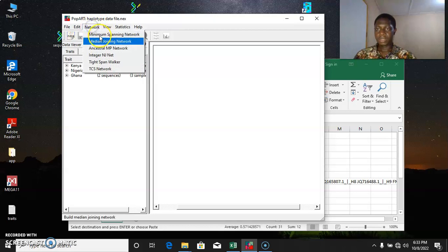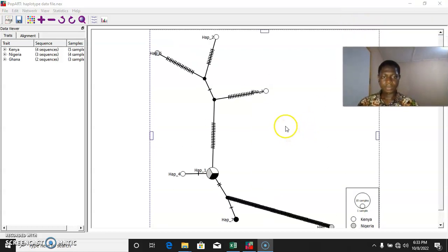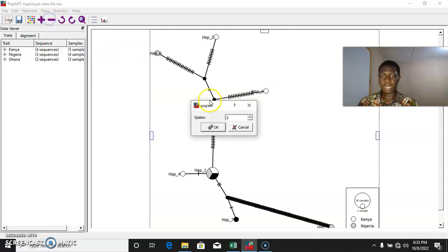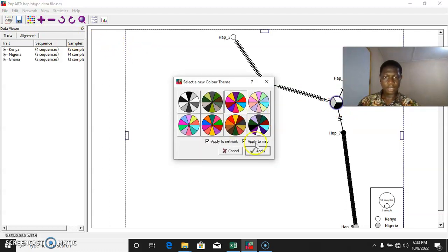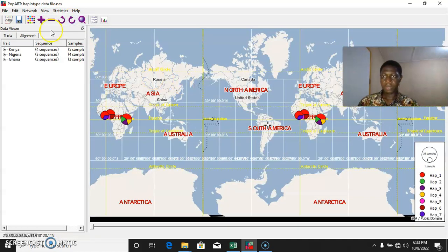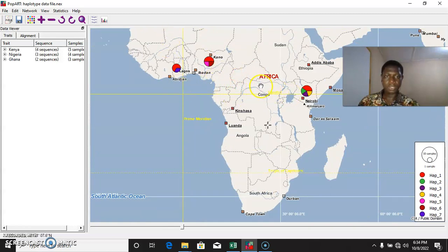So once you have this, you build your network. This is the network. You can use different algorithms to build the network — I initially used TCS. You can use other algorithms depending on your targets. You can also customize the design using whichever style you desire. The haplotype distribution can also be viewed on a map — by coming to View, you view it on map. As you can see, this is Nigeria, this is Kenya, and this is Ghana.